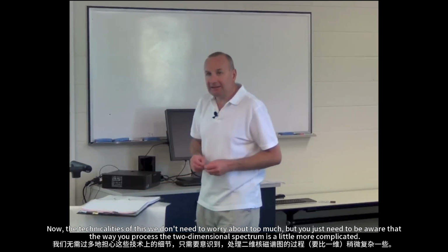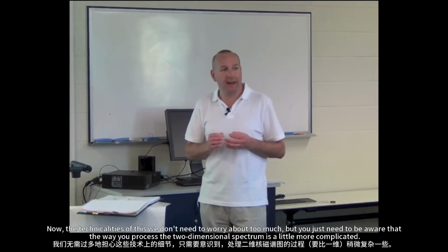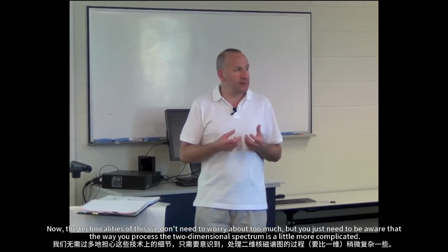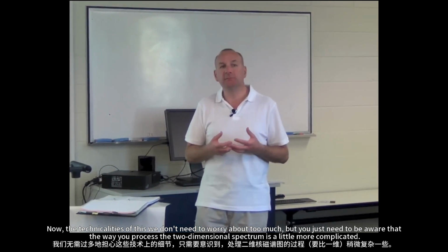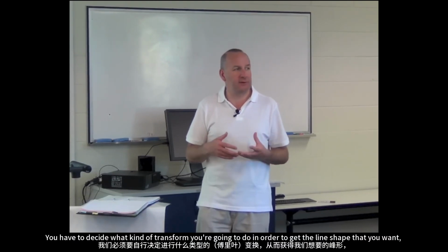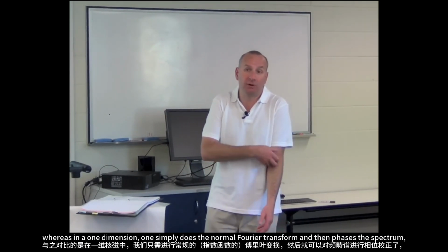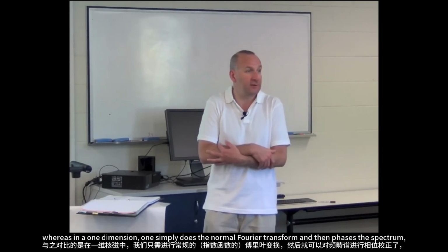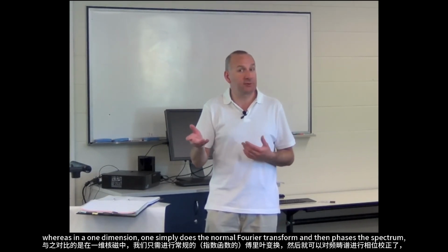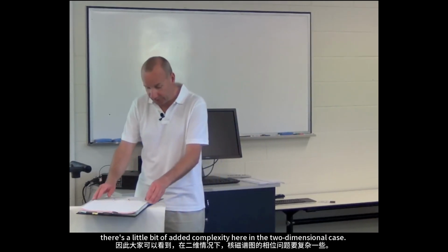Now the technicalities of this we don't need to worry about too much, but you just need to be aware that the way you process the two-dimensional spectrum is a little more complicated. You have to decide what kind of transform you're going to do in order to get the line shape that you want. Whereas in a one-dimensional one simply does the normal Fourier transform and then phases the spectrum. There's a little bit of added complexity here in the two-dimensional case.